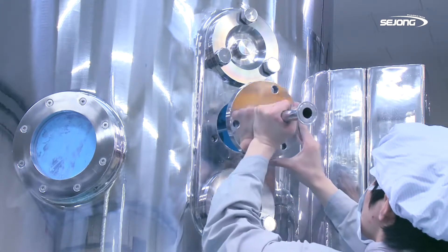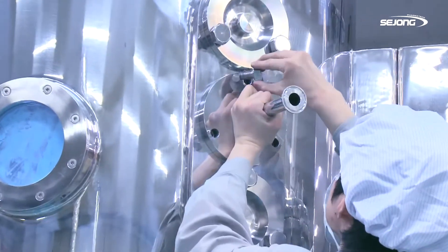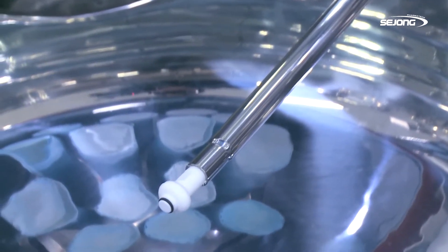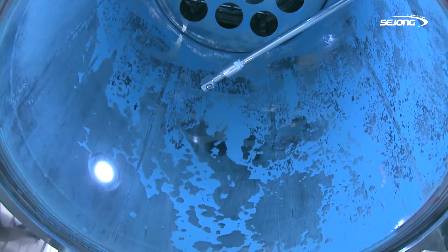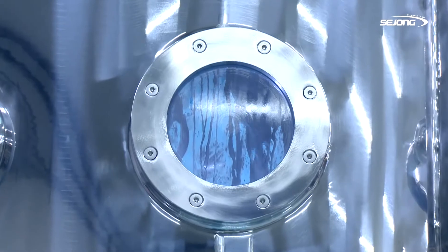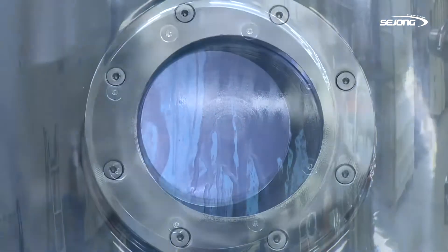CIP is the cleaning system of D-Series and it contains three low-flow rotary turbo nozzles inside the body. By adopting a gear type rotary nozzle and high pressure pump, it can maximize the effect of cleaning with low flow and minimum expenditure of time.